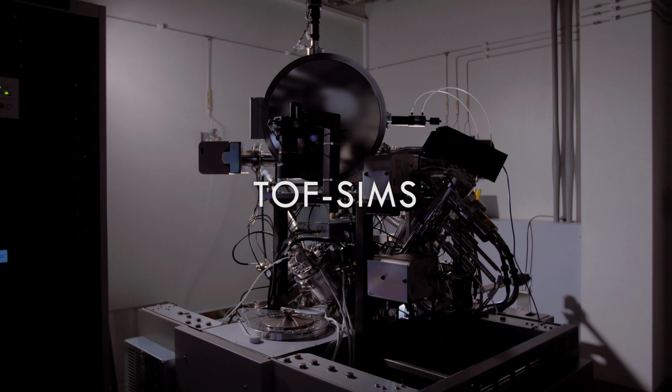Time-of-flight secondary ion mass spectrometry is a surface-sensitive analytical method that uses a pulsed ion beam to remove molecules from the very outermost surface of the sample. The particles are removed from the atomic monolayers on the surface. These particles are then accelerated into an electrostatic analyzer with 3 electrostatic sectors, and their mass is determined by measuring the exact time at which they reach the detector, hence the definition, time of flight. This is how our ToF-SIMS is built to work.